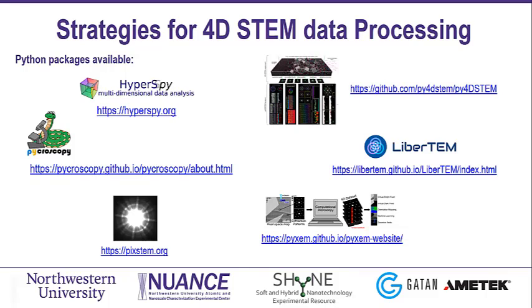You have HyperSpy, which is known for spectroscopy analysis, PyStem, LiberTEM, and most recently Py4DSTEM. They are all open source, and they all have nice functions to apply virtual detectors, from virtual detectors up to strain mapping.